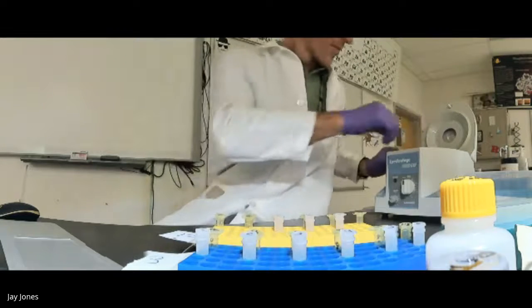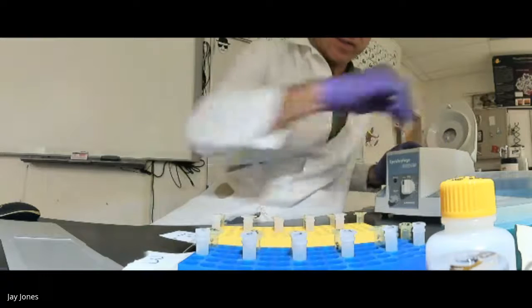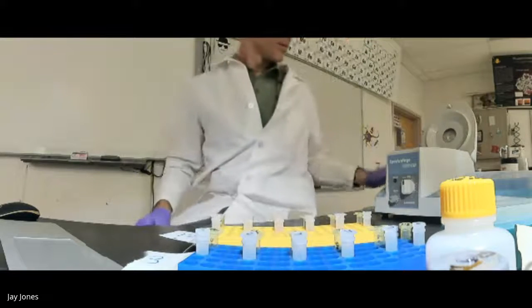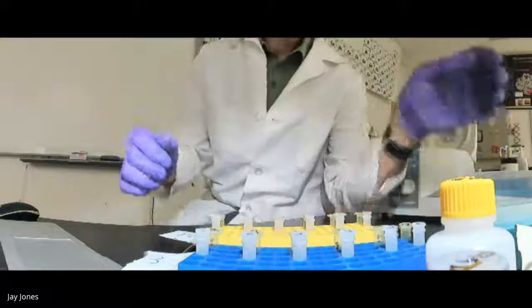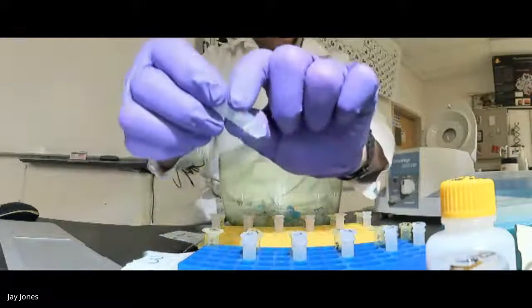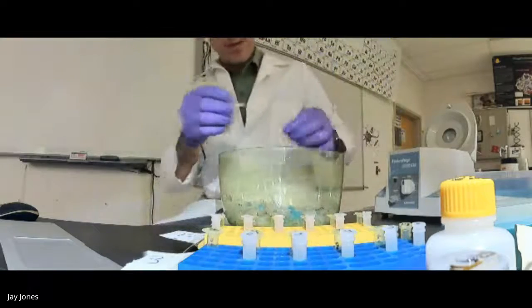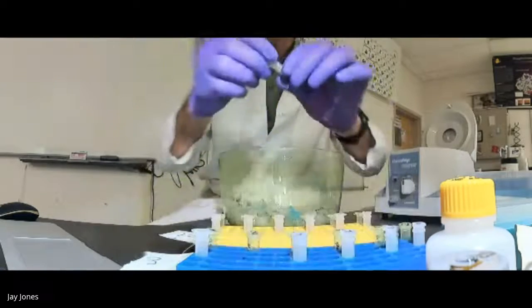The column grabs plasmid DNA. That's its job. It preferentially grabs plasmid DNA. All right. So we have to get rid of all that flow through. If you can see all that liquid, we don't want that. We want the column. So we're going to dump out that liquid from all of these.